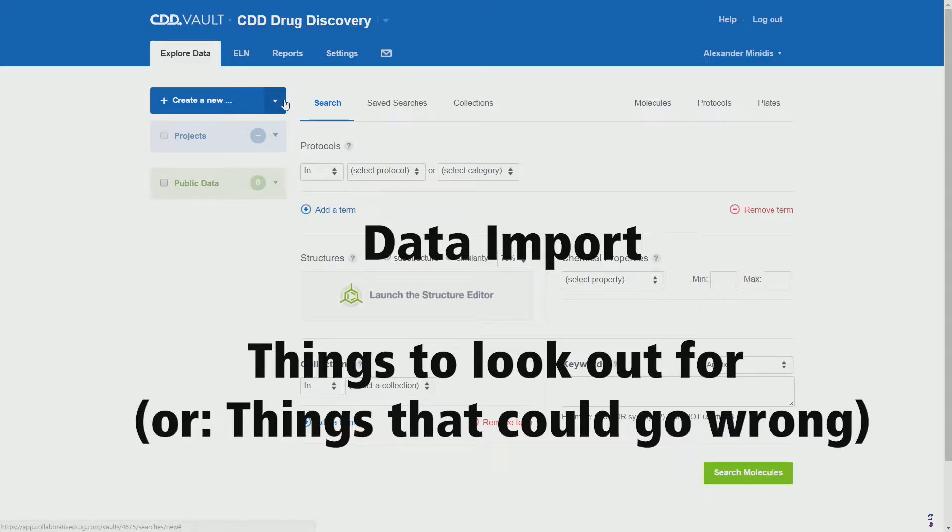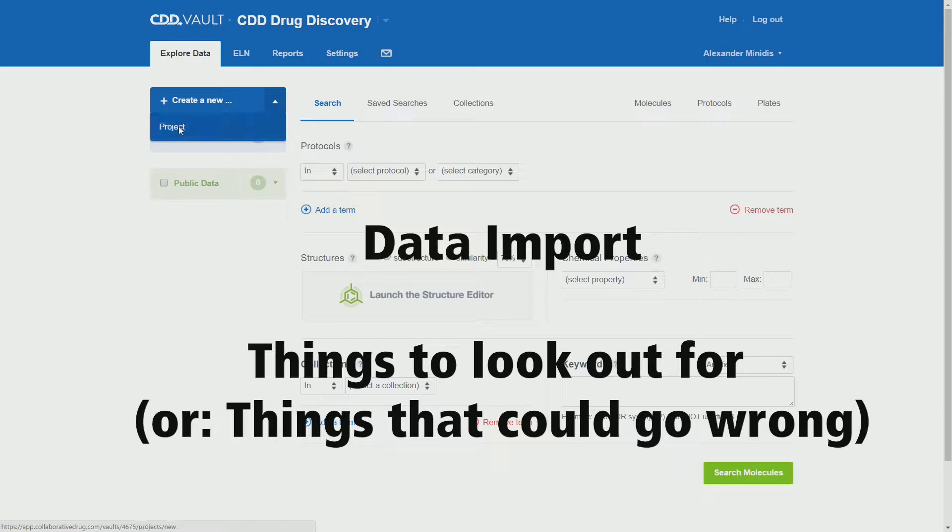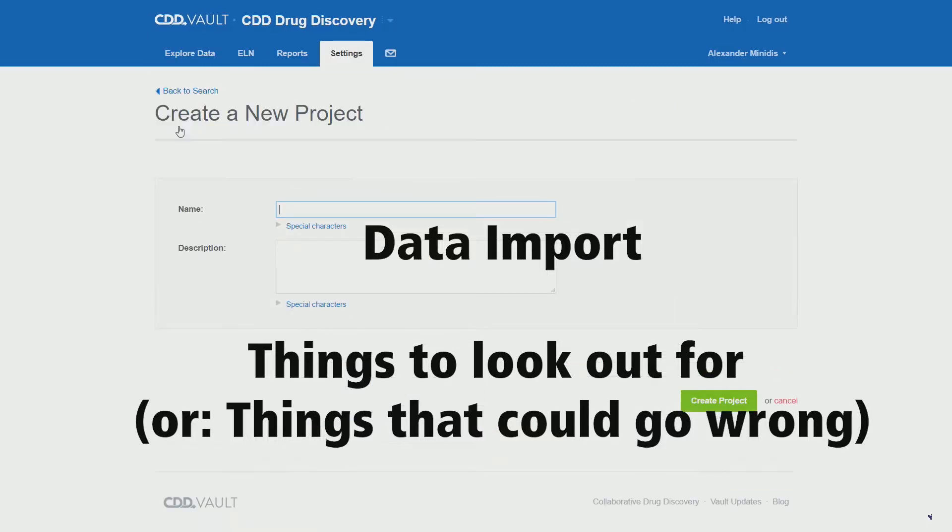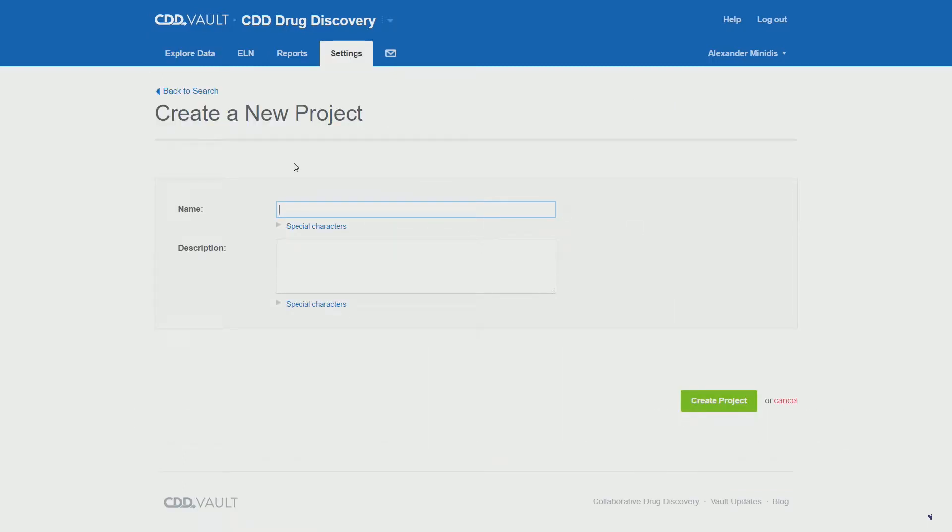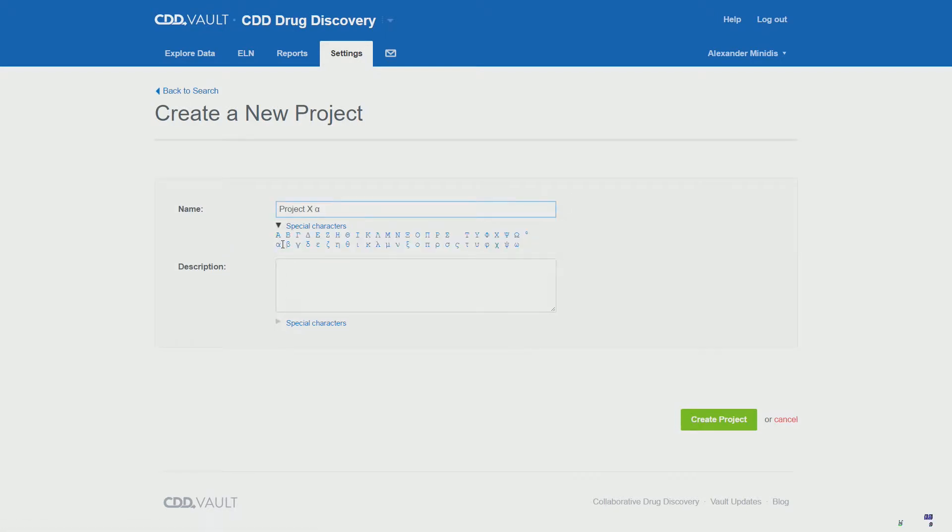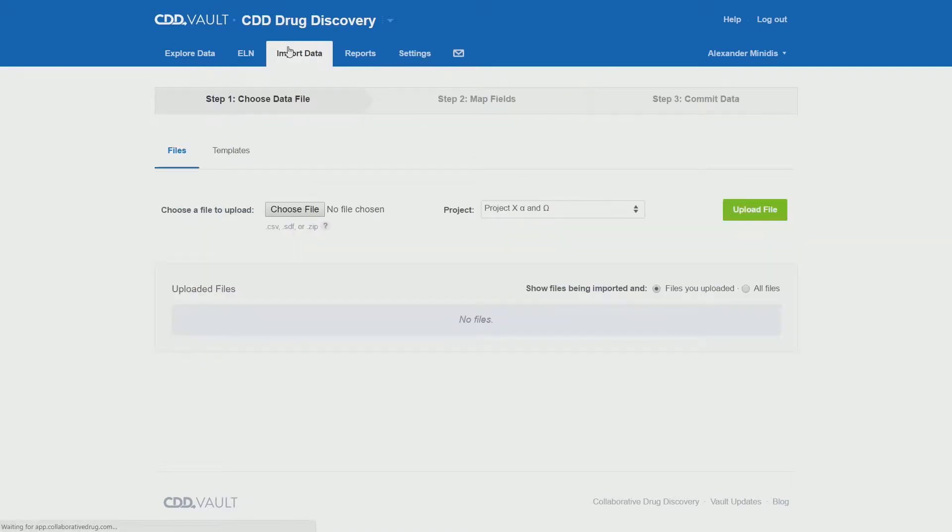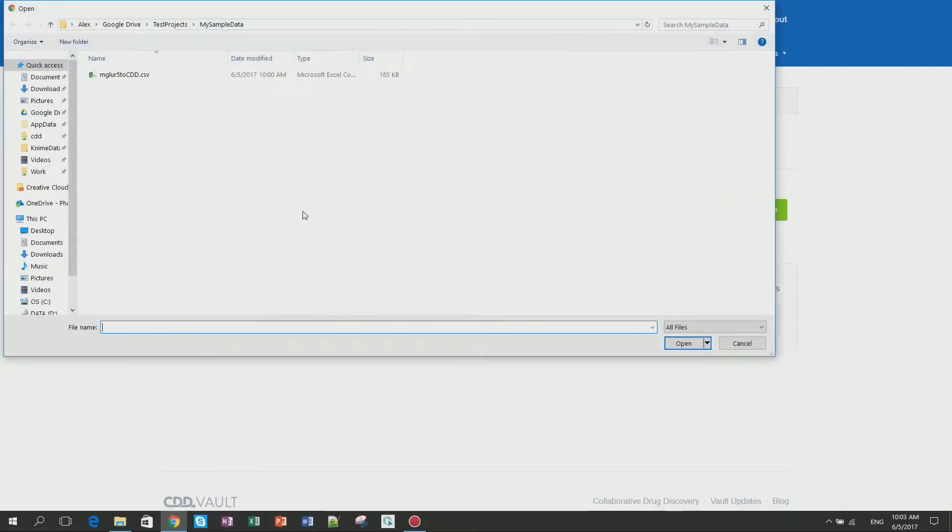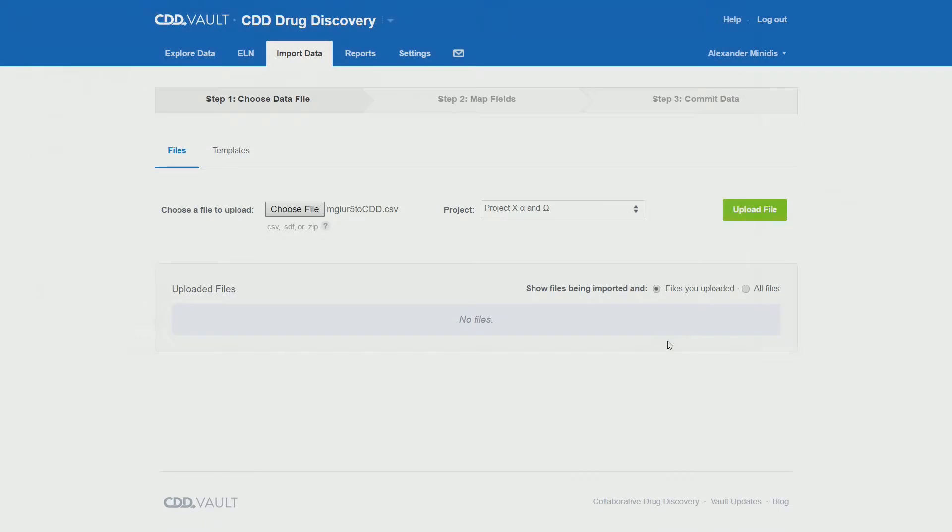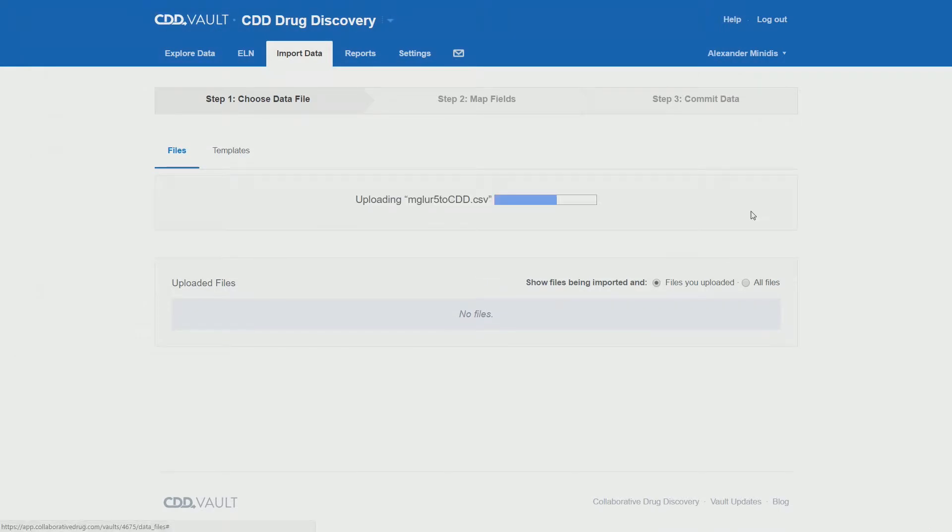Welcome to this episode on data import, specifically things to look out for that could go wrong. First, we start by creating a new project unless we already have one. Once we have that, we can go to the import section, choose the file, make sure we're in the correct project, and upload the file.